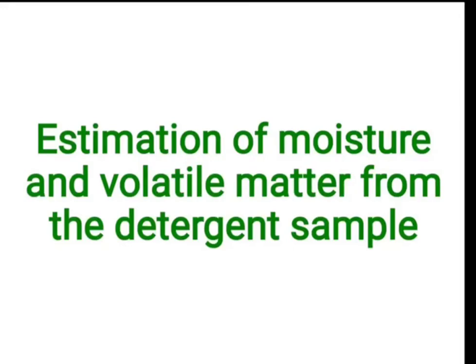In today's lecture, we will find out how the moisture and the volatile matter from the detergents can be estimated. So, we will start with the estimation of moisture and volatile matter from the detergent sample.